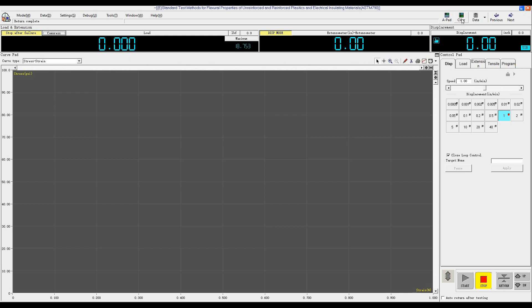Before test, click Clear to zero load extension and displacement. And then you can select the speed, displacement control. One inch per minute. And then click Start test.